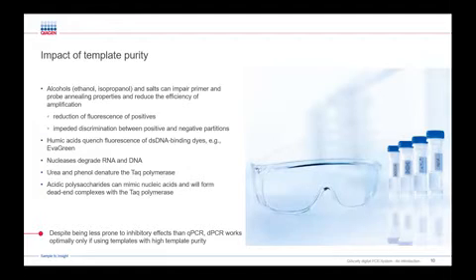You might have heard previously that dPCR is less prone to inhibition, and this is at least partially true. Since we are looking at the fluorescent signals only after the PCR has been completed, a Cq shift, as frequently seen upon partial inhibition in real-time PCR, will not change our dPCR quantification results. However, when it comes to a complete breakdown of the dPCR by inhibitory substances, then also the dPCR experiment is ruined. Therefore, dPCR can only work optimally if templates of high purity are used.